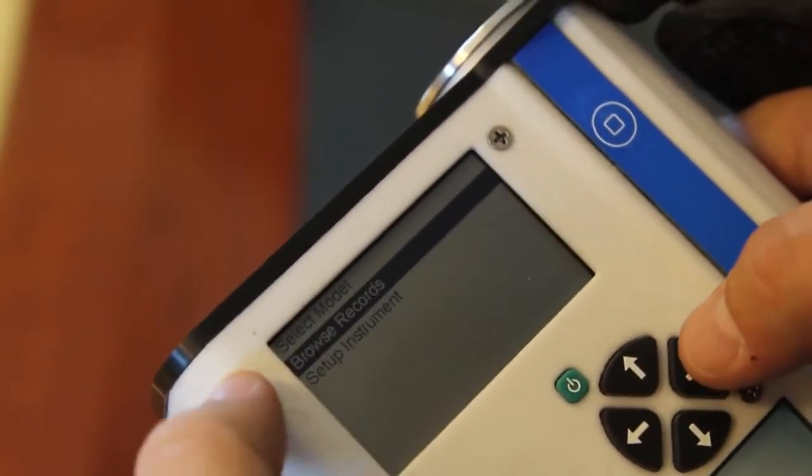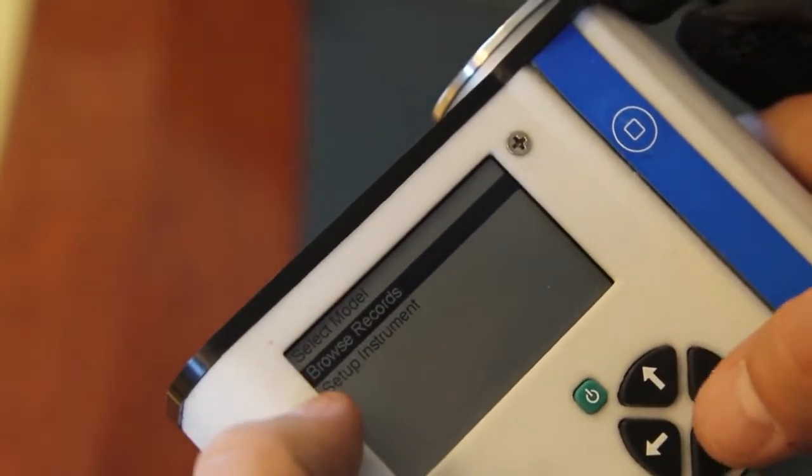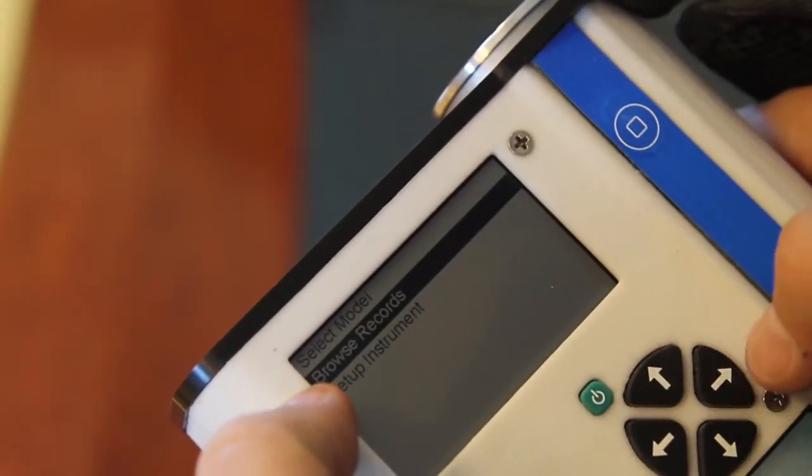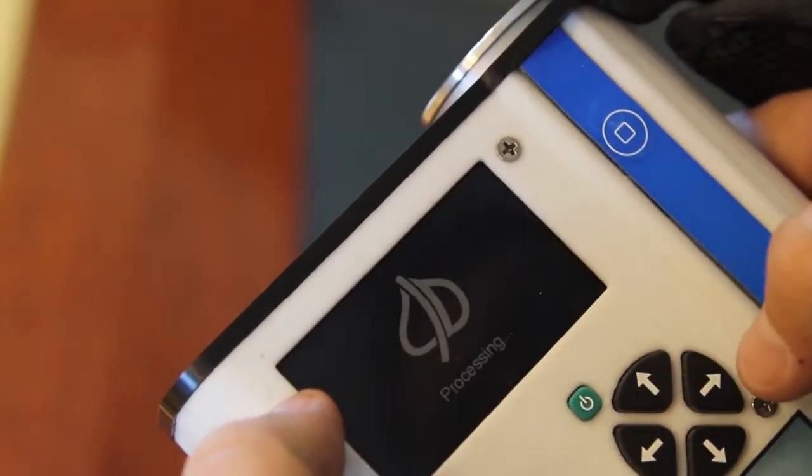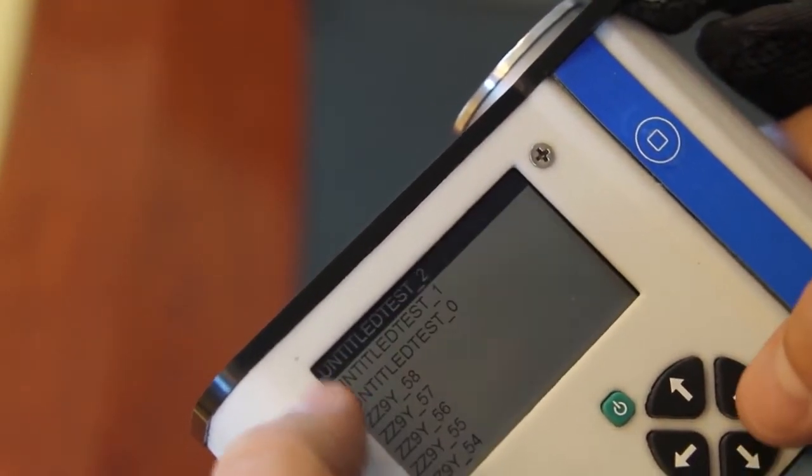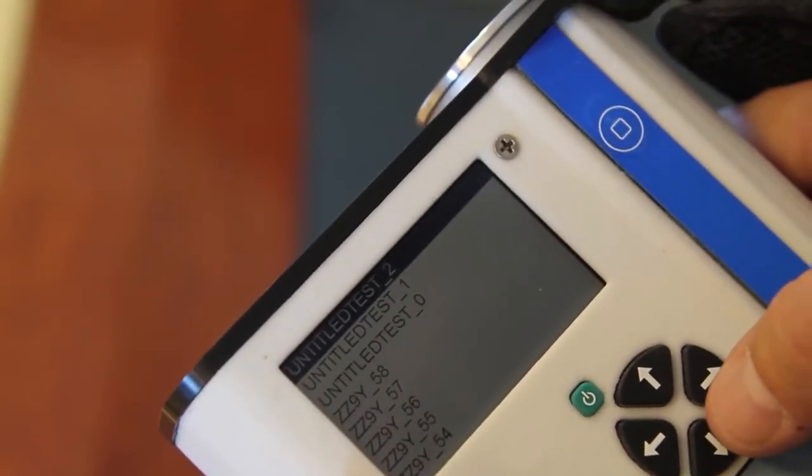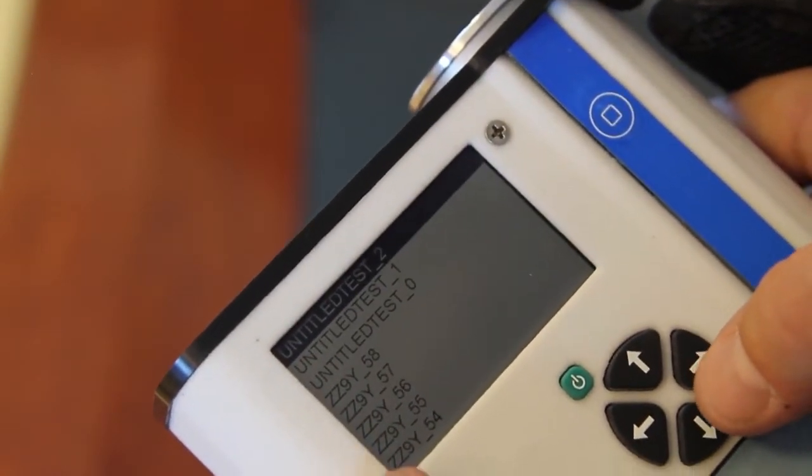If we'd like to view those records again, we just scroll down to browse records and then scroll into that menu. Here we're presented with a list of all the files on the device.